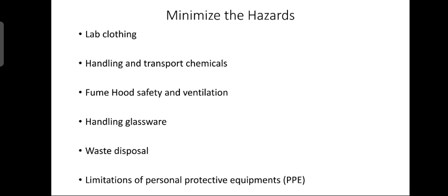Non-flammable, non-porous aprons offer the most satisfactory and the least expensive protection. Lab jackets or coats should have snap fasteners rather than buttons so that they can be readily removed. These coats are to be easily worn while working and removed prior to exit from the laboratory. It is highly recommended that no sandals or open-toed shoes be worn by laboratory personnel in the laboratory. Laboratory clothing should be kept clean and replaced when necessary.